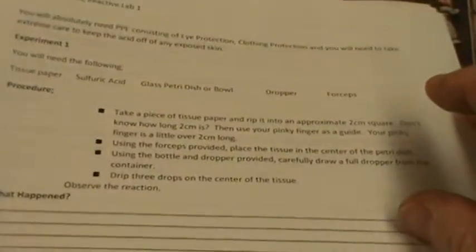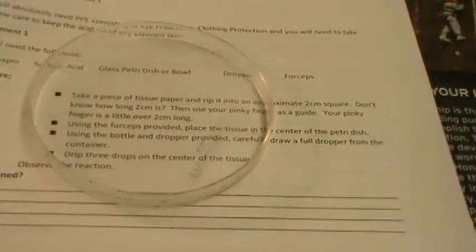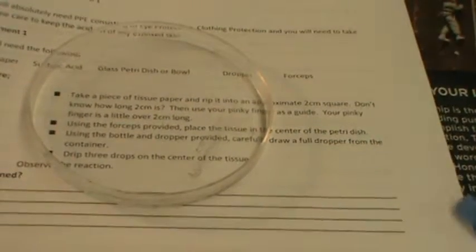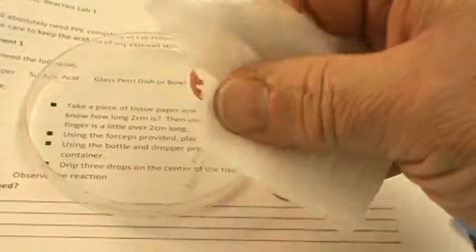So now, here is the first experiment. It says take a piece of tissue paper and get yourself about a 2 centimeter square, and we're just going to cut a square out of it. 2 centimeters, I was telling the students, is about the last 2 knuckles on your pinky finger, so we're going to check it. Yeah, it's more than big enough. We're going to lay that down.